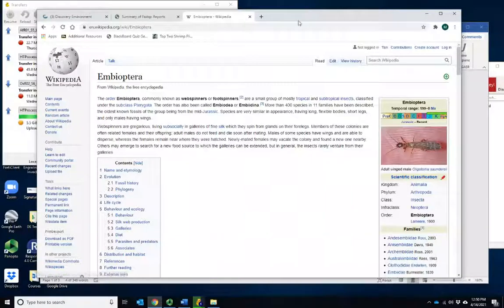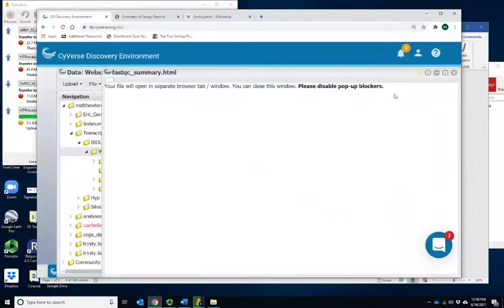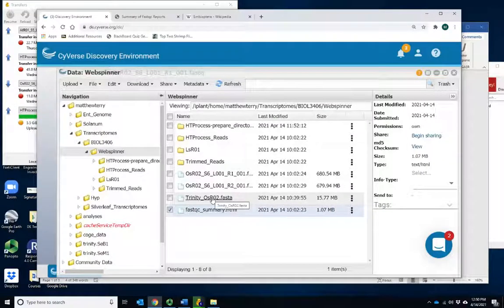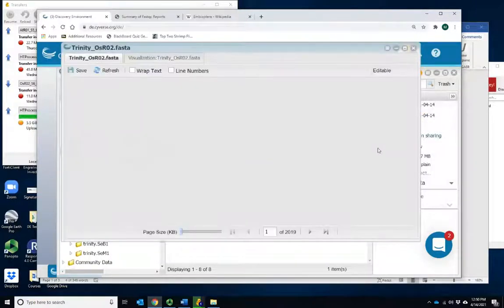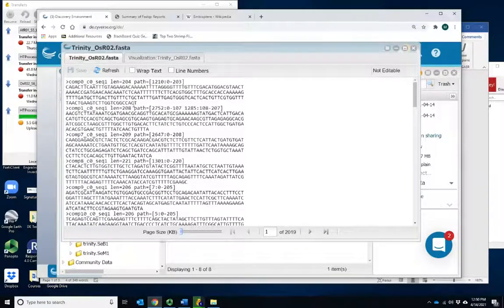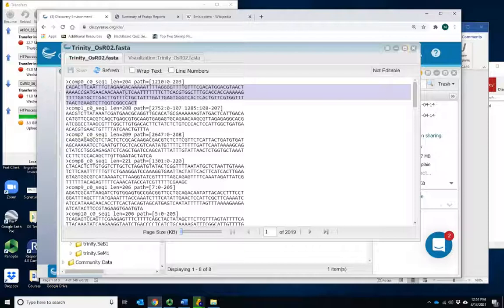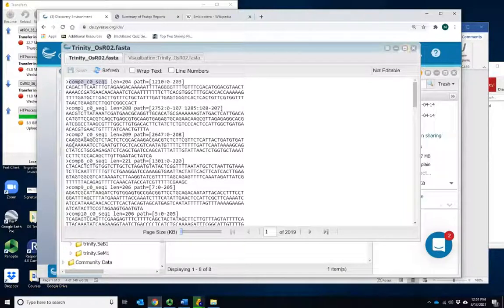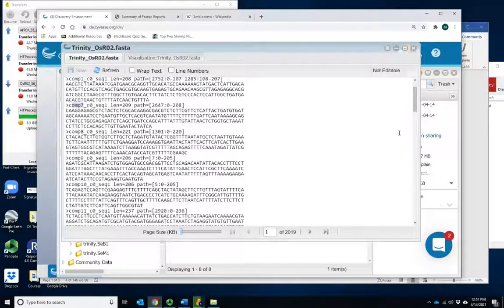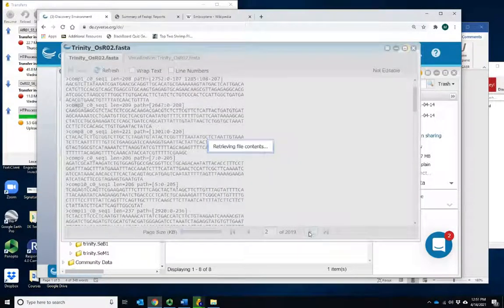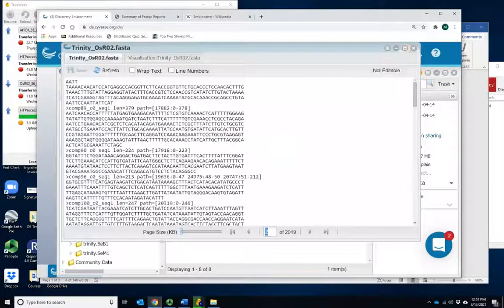Let's look very quickly at the end result of the assembly on Discovery Environment. This is the output — it's actually a much smaller file because we've taken millions of raw reads and assembled them into thousands or tens of thousands of assembled sequences. Here's what each one looks like. Some will be very short — only a couple hundred base pairs long. Each one gets its own unique name: comp one, comp seven, and so on down the line. Let's pick a random one somewhere in the middle. We have 2,000 pages to look at, so let's look at page 1,000.